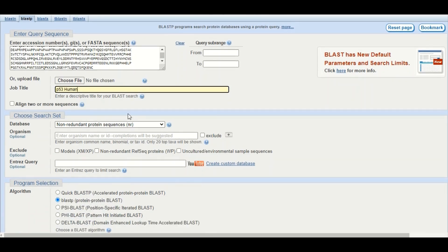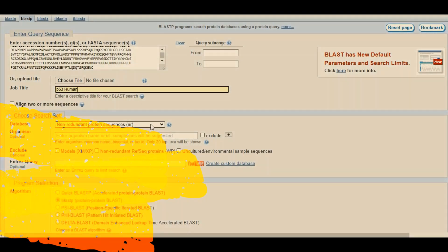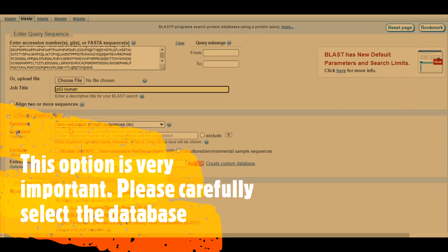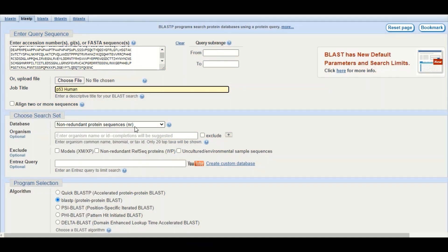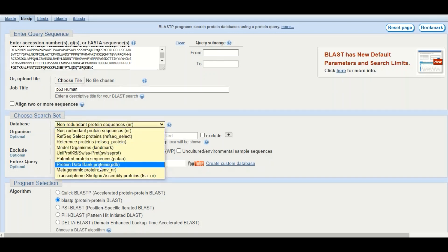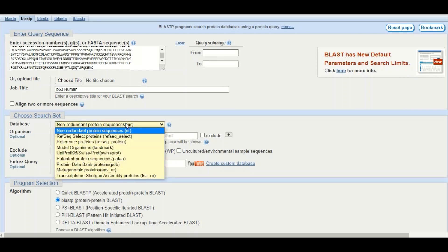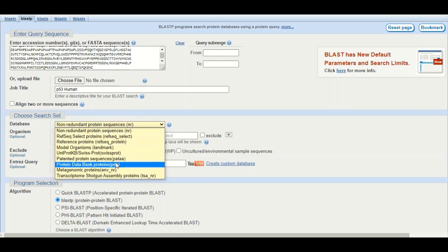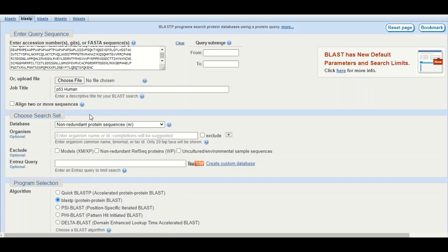The next option is very important: here you select the database in which you want to search for homologues of your protein. By default the non-redundant protein sequence database is selected, and most searches are done using this database. However, sometimes we are interested in specialized databases. For example, if you want to find structural homologues of your protein sequence, you can click the dropdown menu and select the Protein Data Bank. You can select the most appropriate database depending on your study.